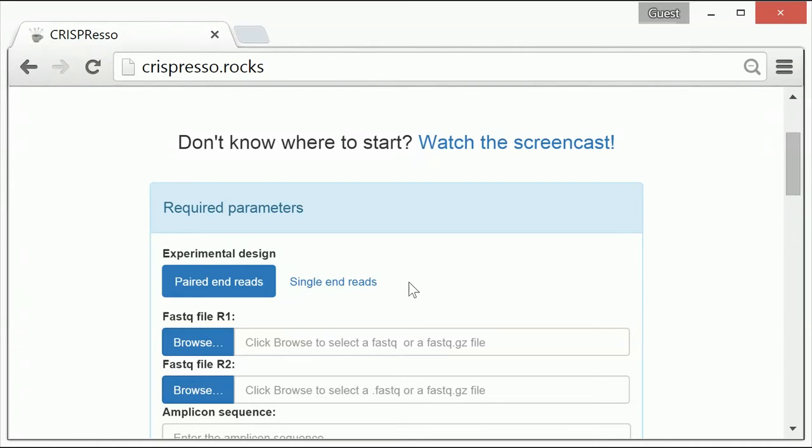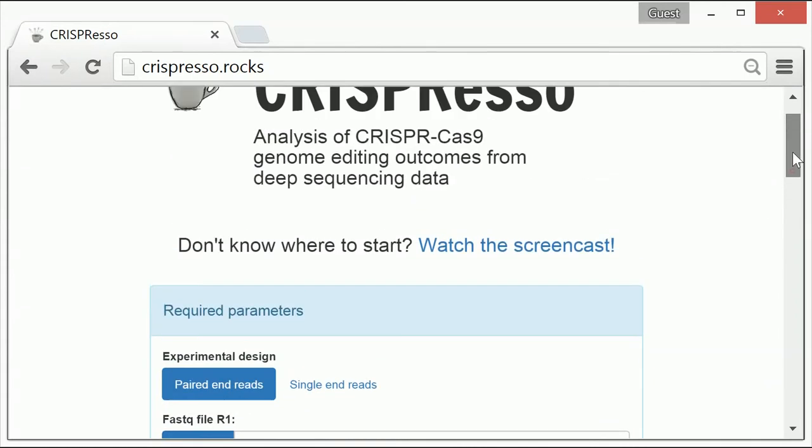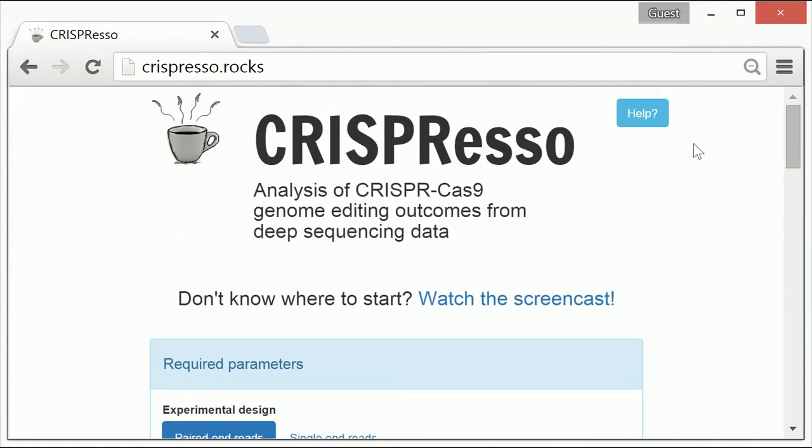As an example, we will use sample data provided on the CRISPResso website, which can be found by clicking on the help button at the top of the CRISPResso homepage. As you can see, here is the help button.